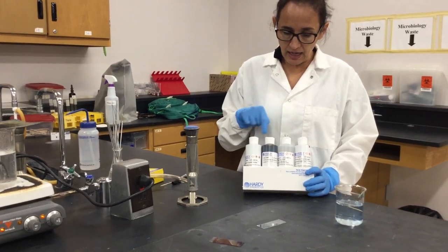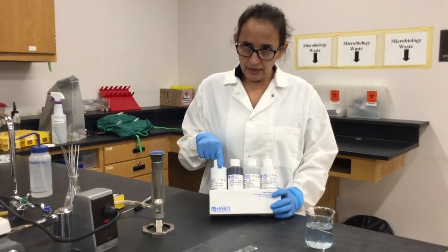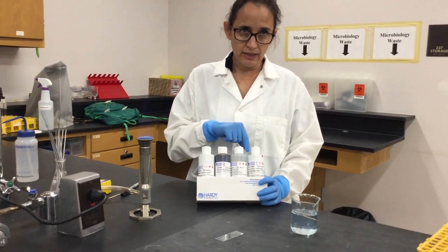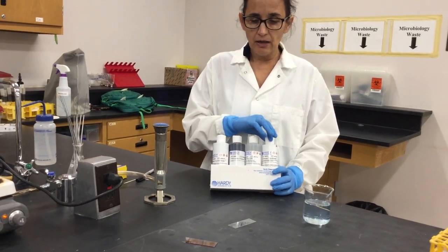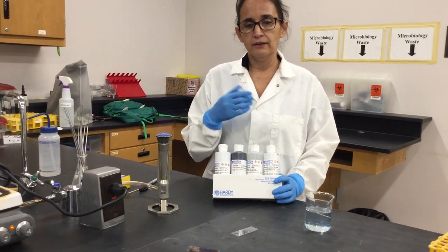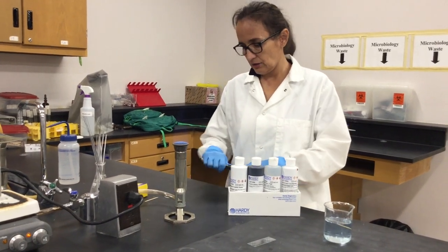So everything up to this step is supposed to be purple, gram-positive and gram-negative bacteria. Now, crystal violet, you add it for a minute, rinse. Iodine for a minute, rinse. And this alcohol, you add it for 10 seconds, and then you rinse, and finally you add your safranin, which is a counterstain that is going to stain gram-negative bacteria, and then you rinse. And then you let it air dry, and then you will observe under the microscope at the magnifications that are required.